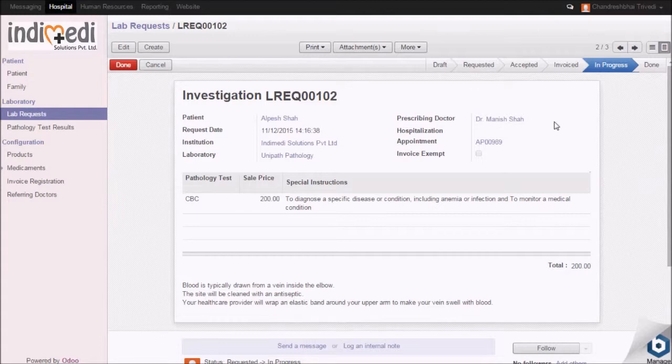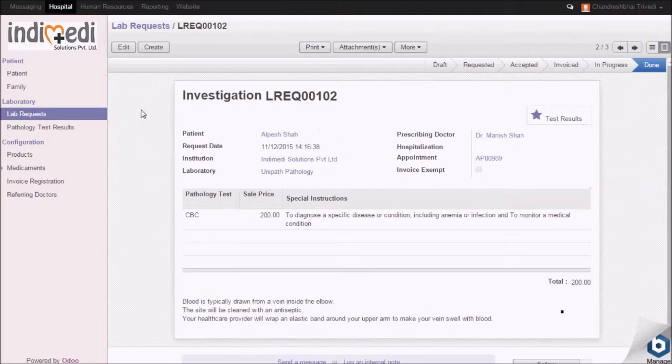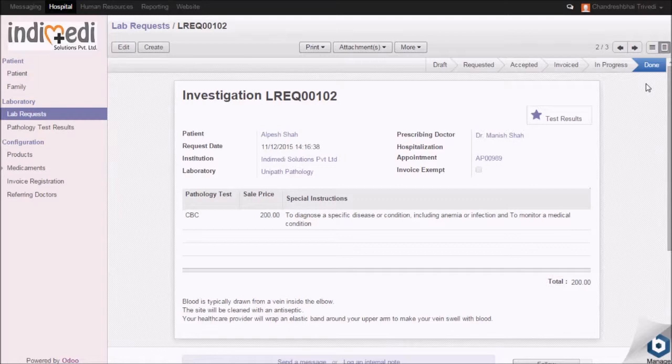On completion of the lab testing, click on done. The stage gets changed to done stage.